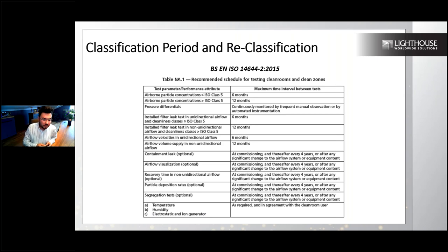Is a 1 to 100 diluter the default diluter for particle counters? No, we have, for example, 1 to 500 as well. It will be different from manufacturer to manufacturer. But keep in mind, if you are using 1 to 100, you will be generating fewer particles with your aerosol generator. 1 to 500 will allow you to generate more particles in centralized systems, but it's not the defined value, 1 to 100. There are different types of diluters as well.